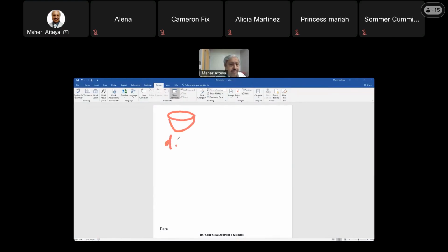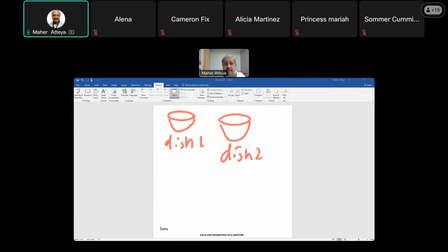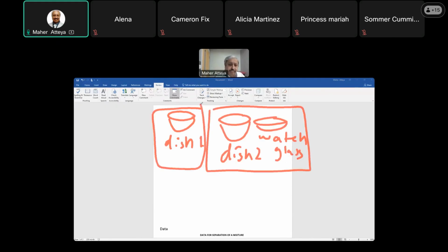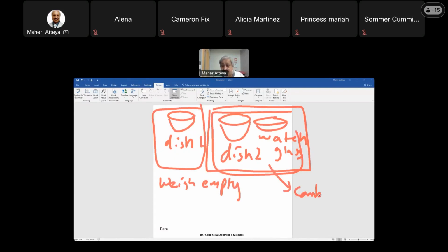You will have two dishes. That's dish number 1. Dish 1. And then you have dish 2, and with its watch glass. So you will weigh each one separately, empty. You will weigh first what? You will weigh each one empty, and this is the combined weight. Okay, guys? So this is first what you have to do.